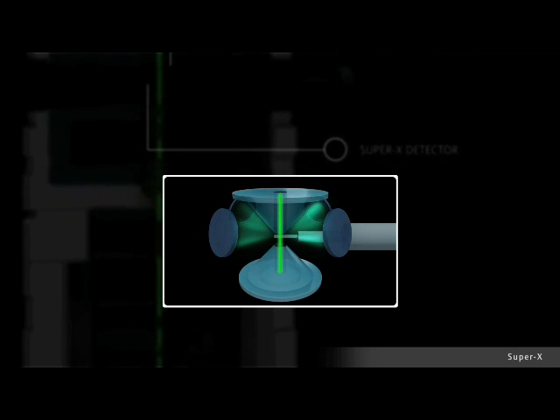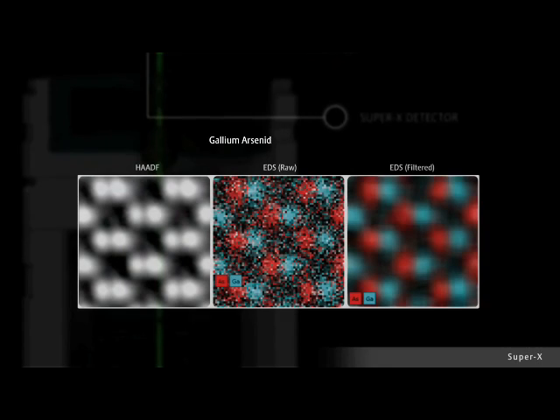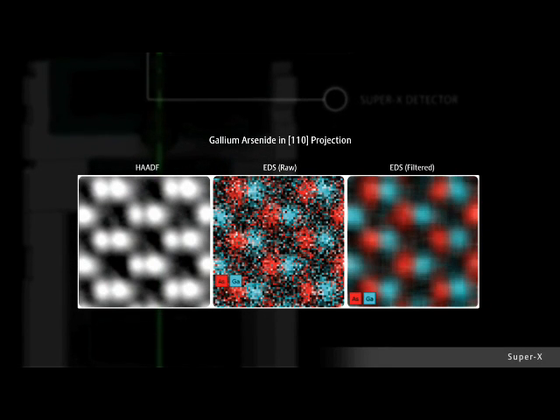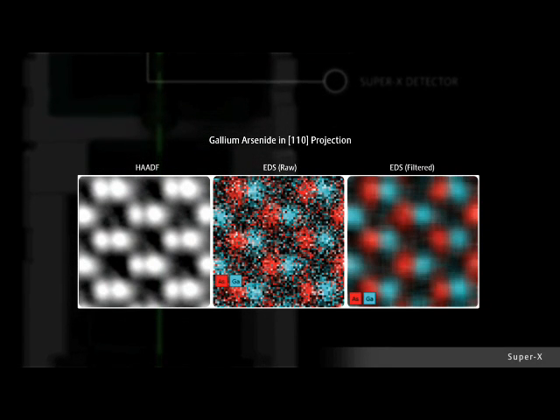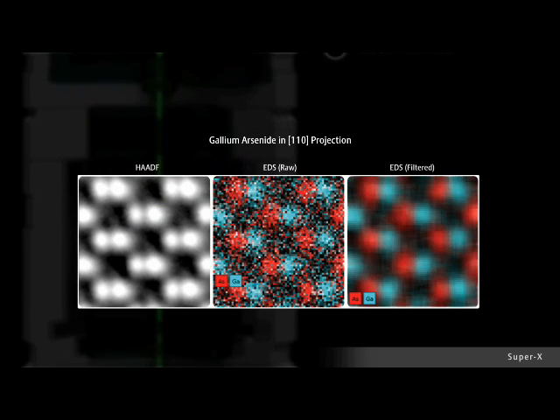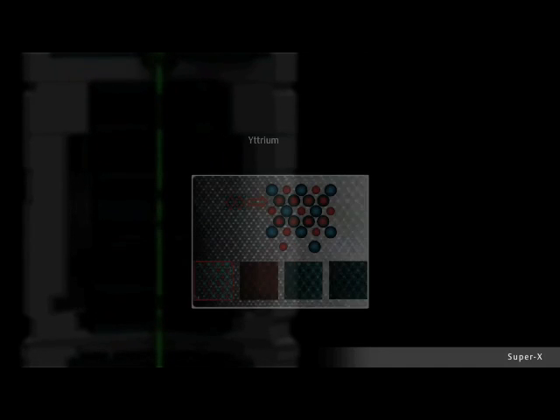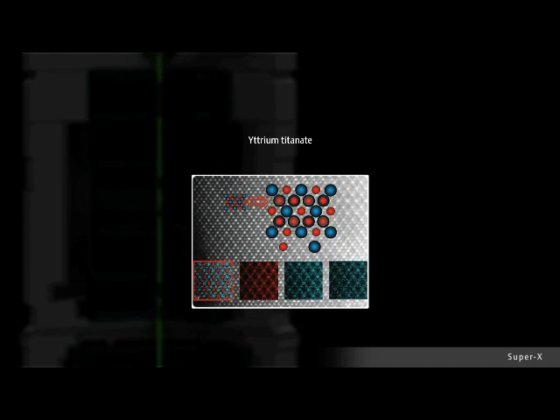In combination with a probe CS corrector, the SUPER-X detector enables atomic chemical mapping as shown in the example of gallium arsenide in 110 projection. The polarity of the structure can be visualized by the additional information of the different chemical content of the dumbbell structure. Even the difference in chemical composition between mixed and pure atomic columns can be detected as shown in this example of yttrium titanate.